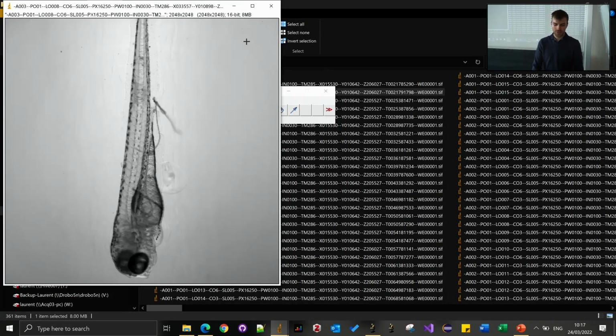But what's important for me to show you for this use case is that, as I said, they're vertical. So if I draw a rectangular region of interest like this, I'm pretty sure that I'm going to have all the image I want, all the samples. The data on the sides I can discard, that's just background, and that's going to save me a lot of data. That's about 2/3 of the image which is not useful, so if you multiply by the number of images, you reduce the size of the dataset by 2/3.